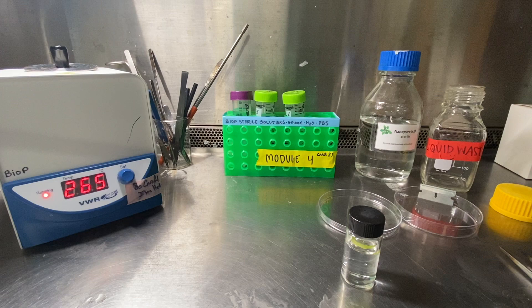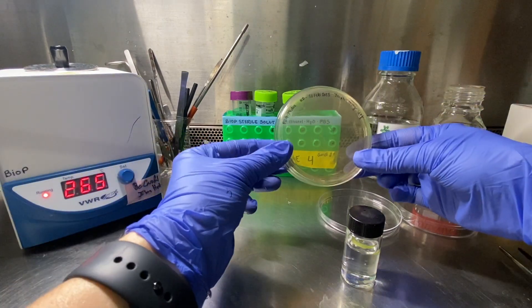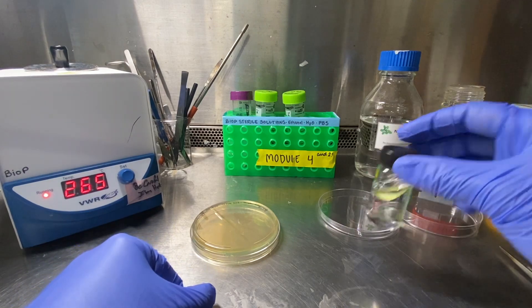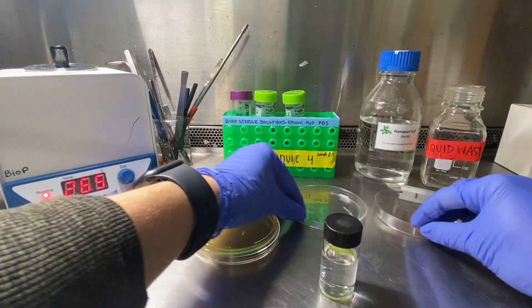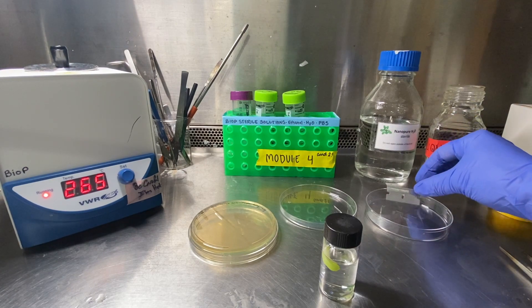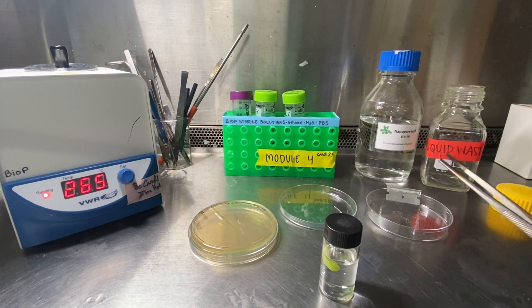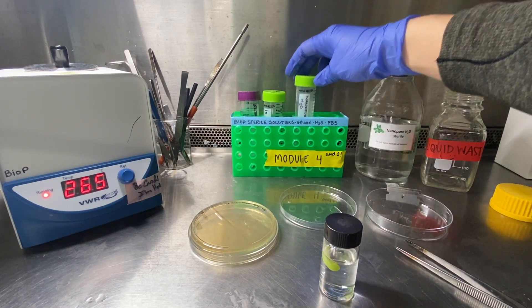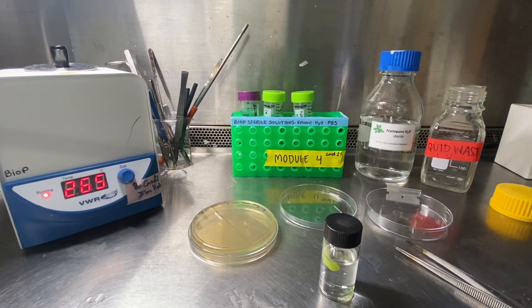Then under the bio hood, once you have shaken your leaf for 10 minutes, you're going to make sure you have your media plate labeled, your leaf in sterilization solution, a razor blade, some forceps, a source of nano-pure water that is sterile, and your liquid waste container.